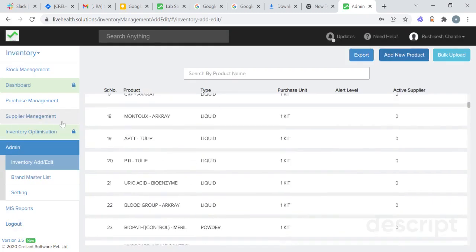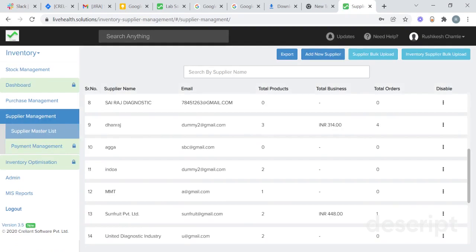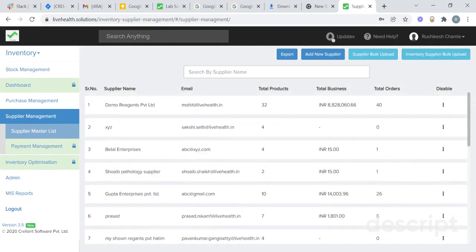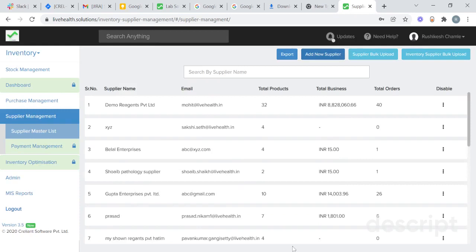You will also be able to add your supplier in supplier management. Go to supplier master list. You will get a list of your current suppliers. To add a new supplier, click on add new supplier. Add your supplier name, email, contact number, address, and click on save. That new supplier will be added here.